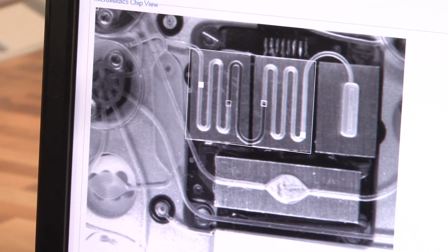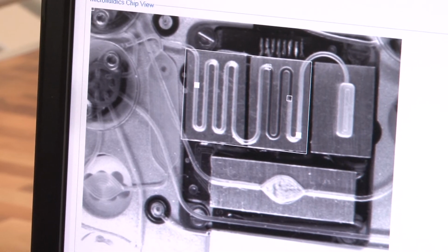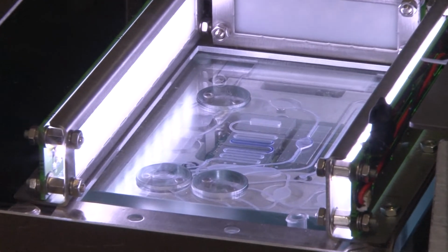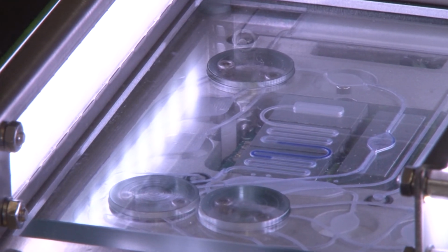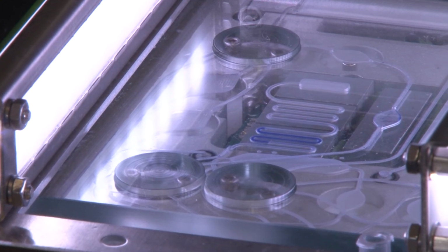The whole procedure lasts 40 cycles, and at the end we have an amplified DNA sample. What you can see here is the image taken directly from the instrument with the use of the camera control.